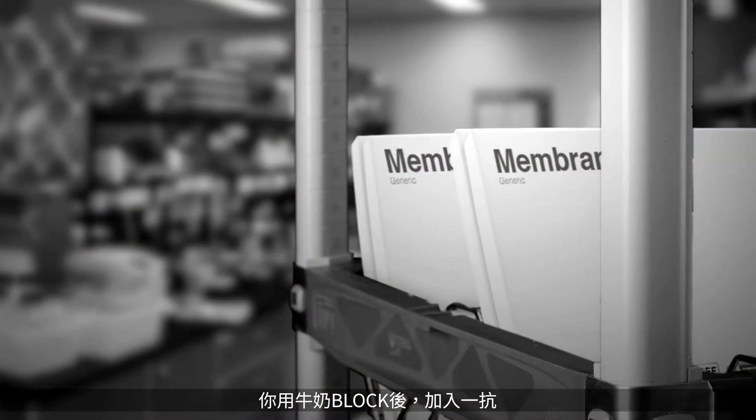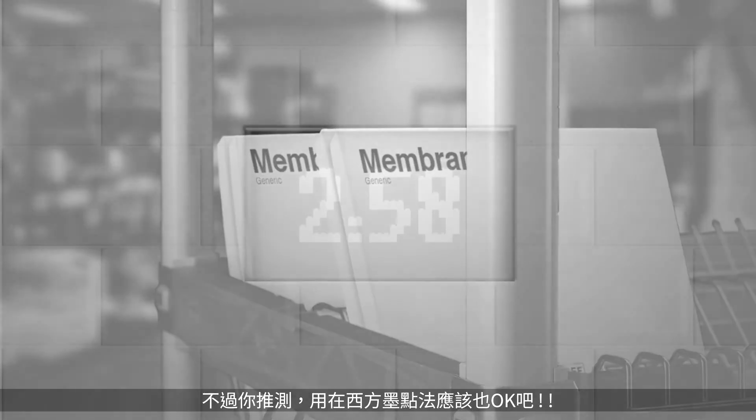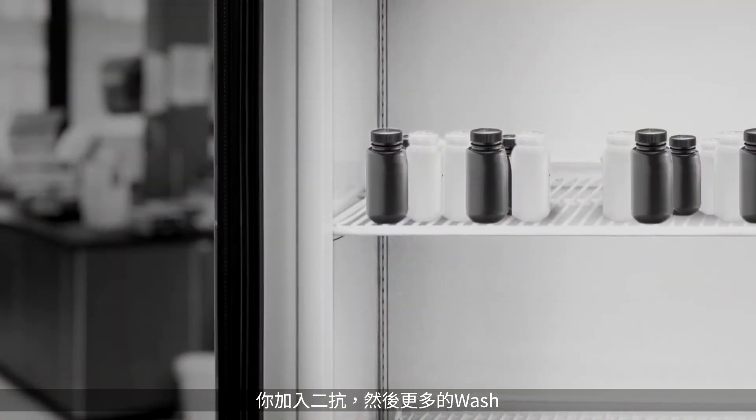You block with some milk and incubate with primary antibody. You've only used it for flow cytometry before, but it should work in a Western, you think. Now for some washes — I'm shaking, I'm shaking. You repeat with secondary antibody and more washing.